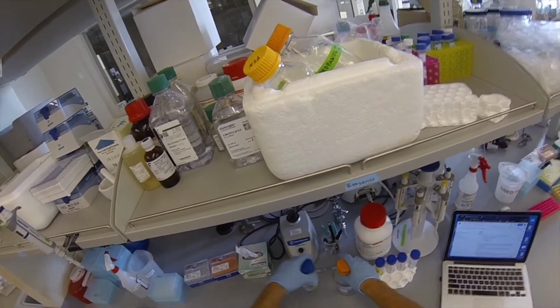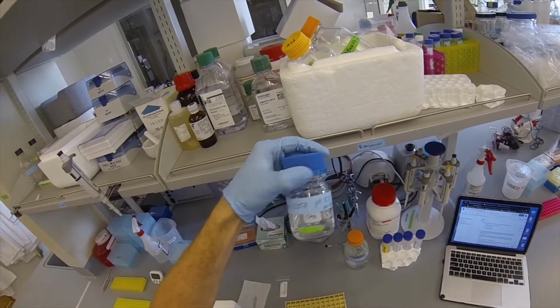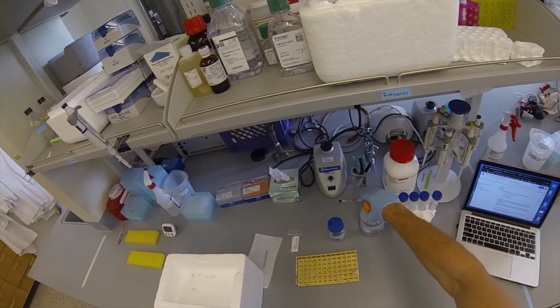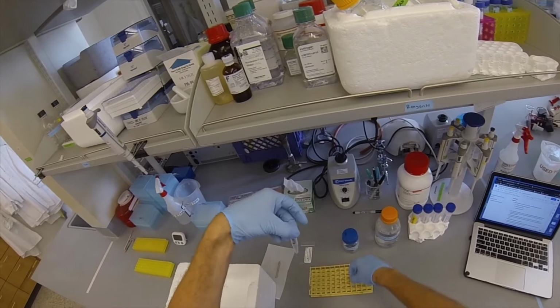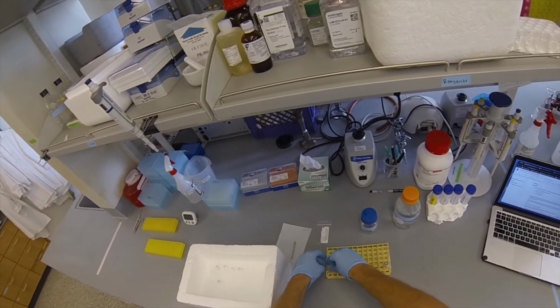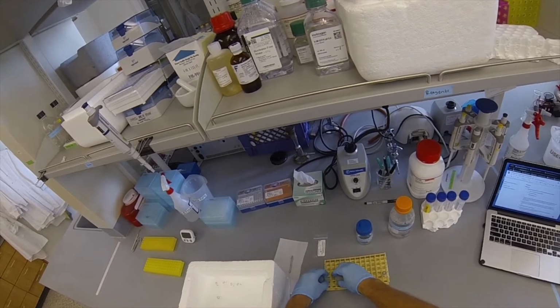Now you're going to lay out all of the reagents you need for the cell lysis step. This includes the 1% SDS cell lysis buffer, 0.5 molar EDTA, and the proteinase K. You can also line up your samples in the yellow test tube rack that will be used in the water bath.